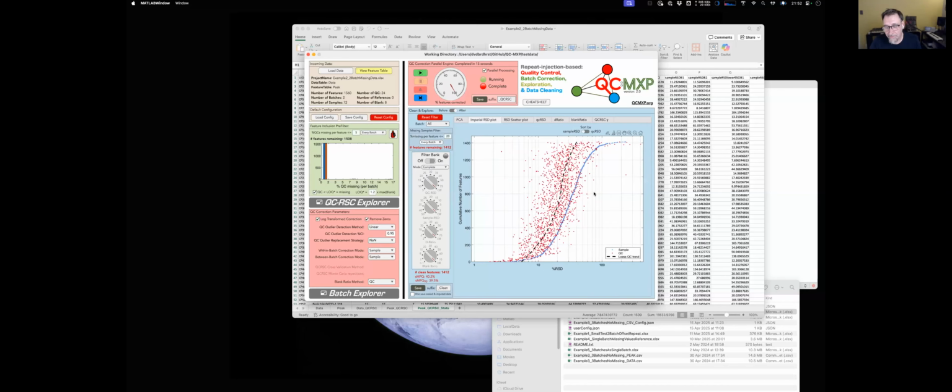Now, look at that. You can see when we've corrected on the sample, look how close that distribution is to the blue line, showing you that it's not that great. Now watch this. I do a 40% D ratio. Look what's left. Yeah, it's harsh, but that's what it's doing.